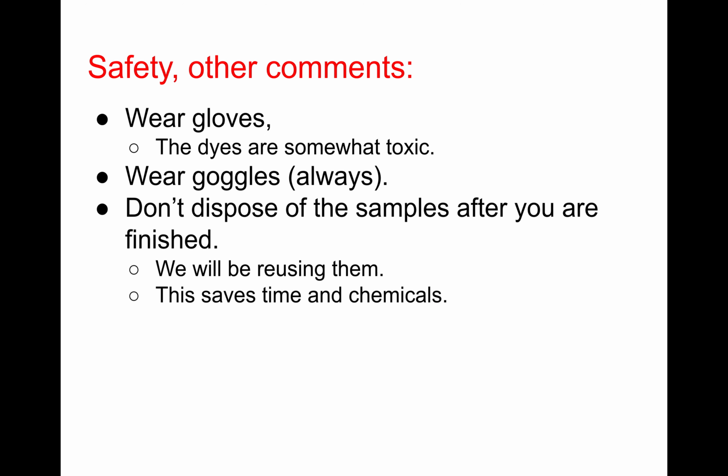Okay, safety. Again, always wear gloves. The dyes are somewhat toxic and carcinogenic. Always wear goggles in any laboratory settings, and don't dispose of the samples when you're done. We will be reusing them. Okay, this will save the chemicals. It'll save time, and this is more environmentally friendly. Okay, thank you.